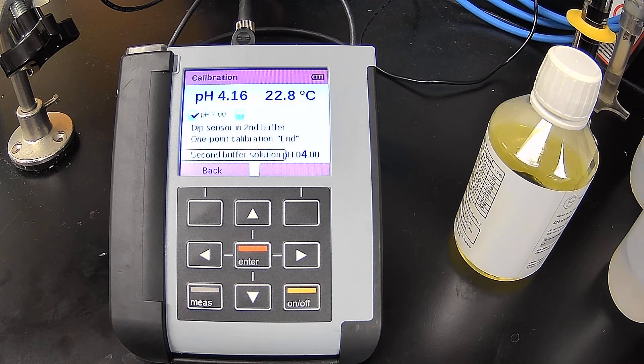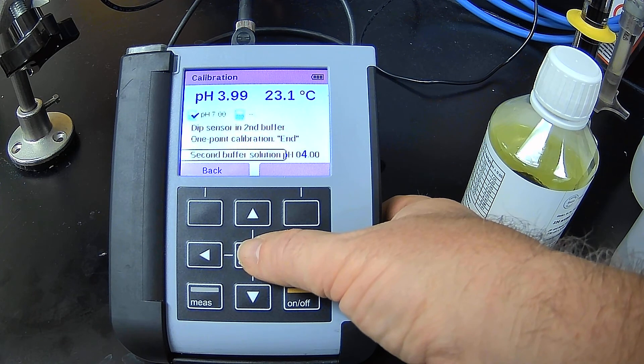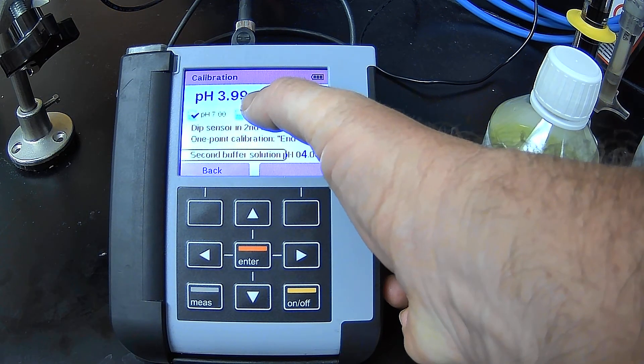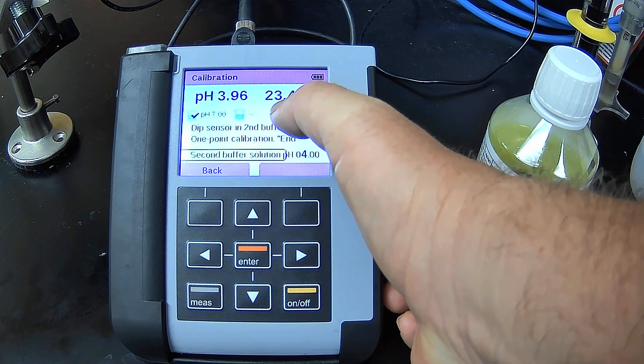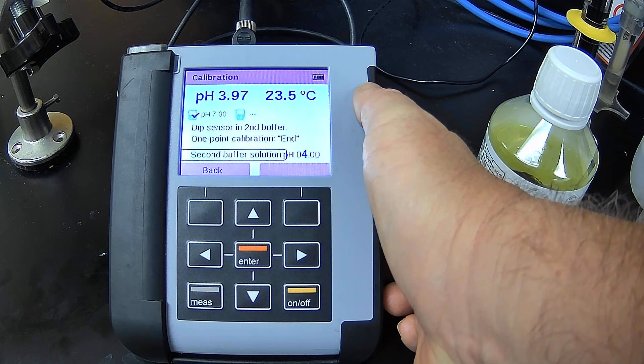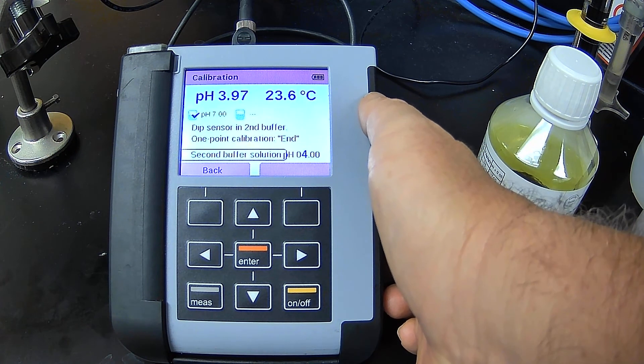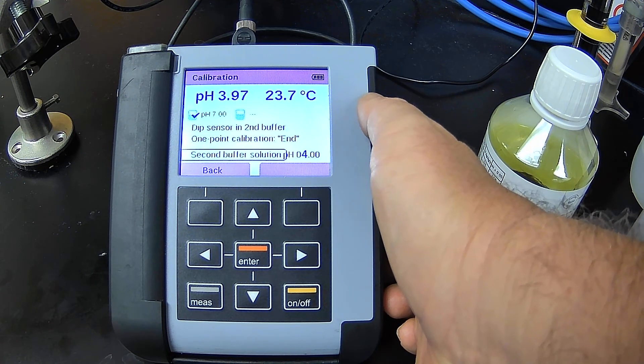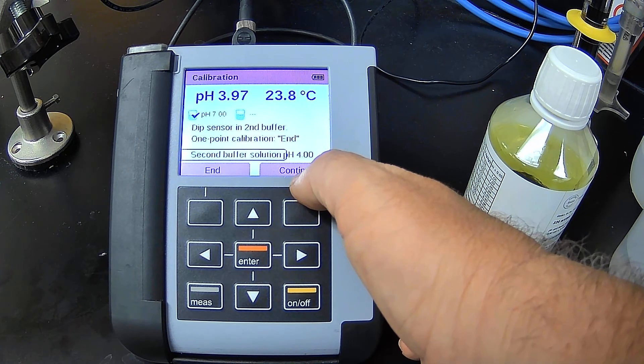Stir it just a little bit. Now, right now, I'm going to let it stabilize. So I want to make sure that my pH value is stable. And I also want to make sure my temperature is stable. And patience is important here. So you want to make sure that it's not moving in value more than once per second. So pH value looks pretty stable. Temperature, I would say we're also stable. So I'm going to go ahead and hit enter here. So it gets me ready to continue.